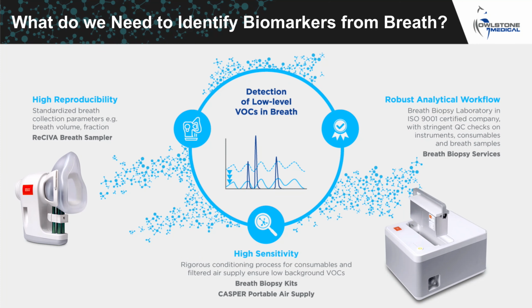So what else do we need to identify and validate biomarkers from breath? The answer is an entire platform that is reproducible, sensitive, and robust. We also need end-to-end workflows right from sample collection through to analysis.